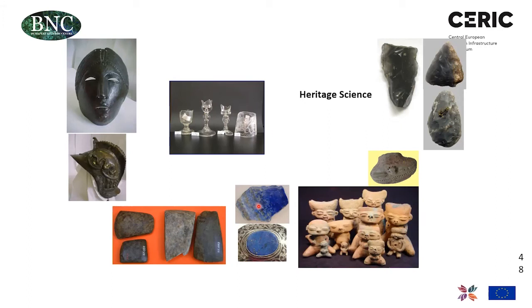Similar provenance study can be done by trace element composition for lapis lazuli samples.